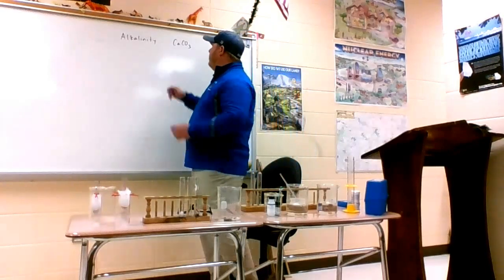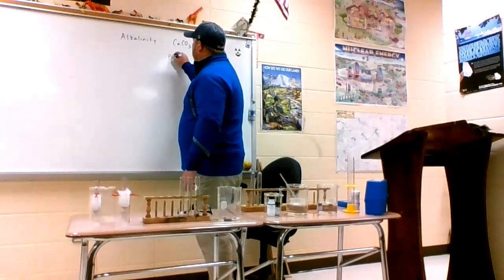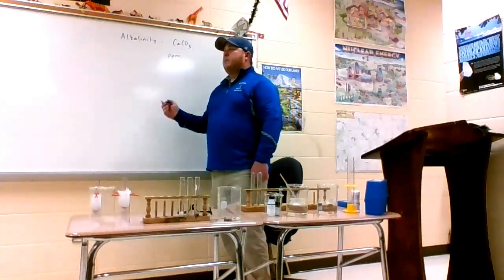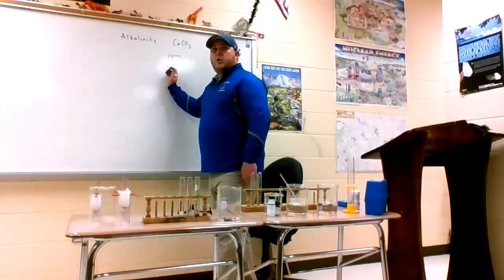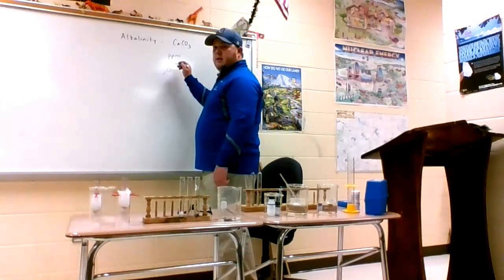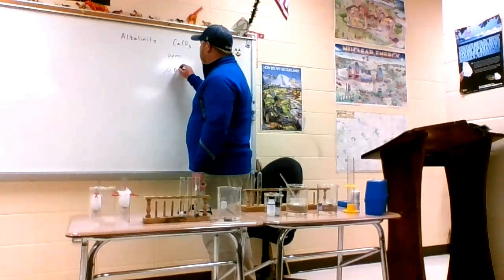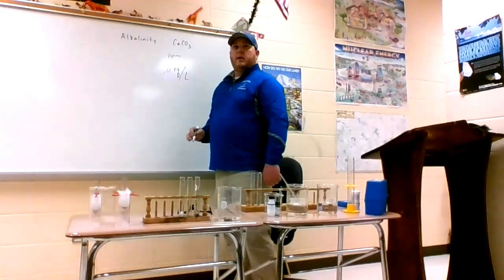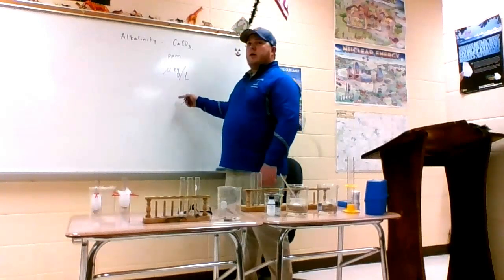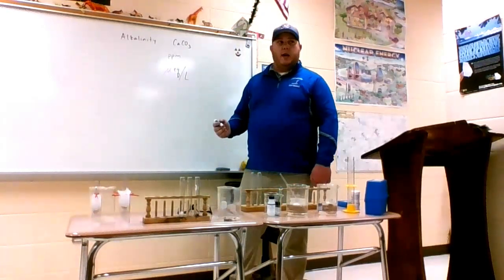Okay, we measure this in parts per million of calcium carbonate. Another way you can express this is milliequivalents per liter, or, I think your lab puts it in microequivalents per liter. And the conversion factor from parts per million to microequivalents is you multiply by 20.